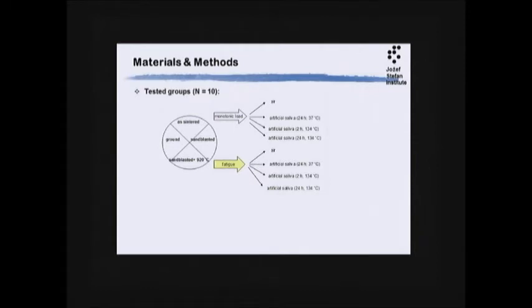They were either aged in artificial saliva for 1 day at 37 degrees C, or for 2 hours in an autoclave, or for 24 hours in an autoclave. The reason for these groups, sandblasted plus annealed, is that after 920 degrees C, the monoclinic phase that was on the surface after sandblasting will transform back to the tetragonal.